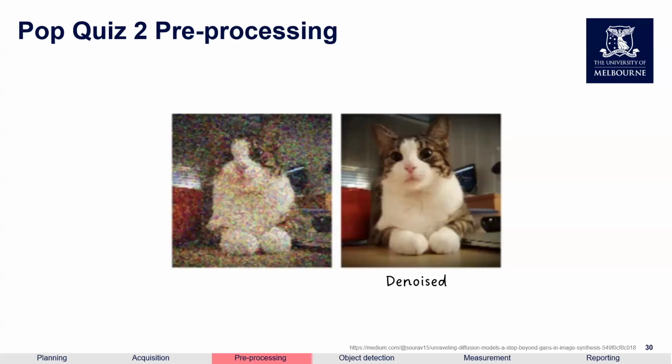Also, we cannot improve the bit depth. If we have taken all these signals in 8 bits and the grayscale is only 256, we cannot make it into 4000s, which would be just empty amplification. So saturation and bit depth have to be controlled during acquisition.